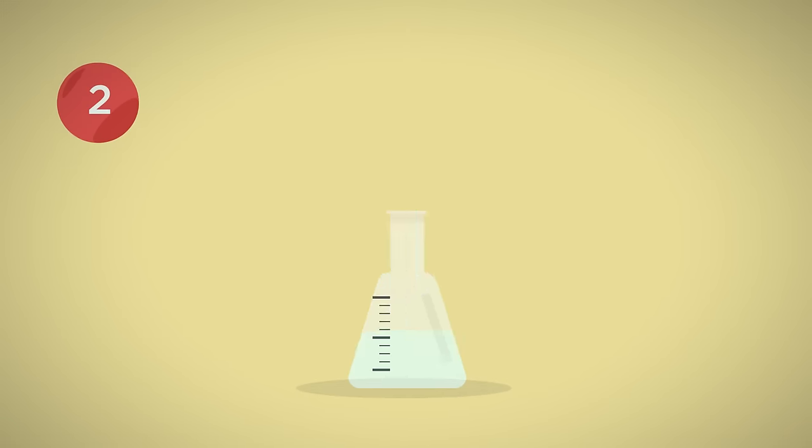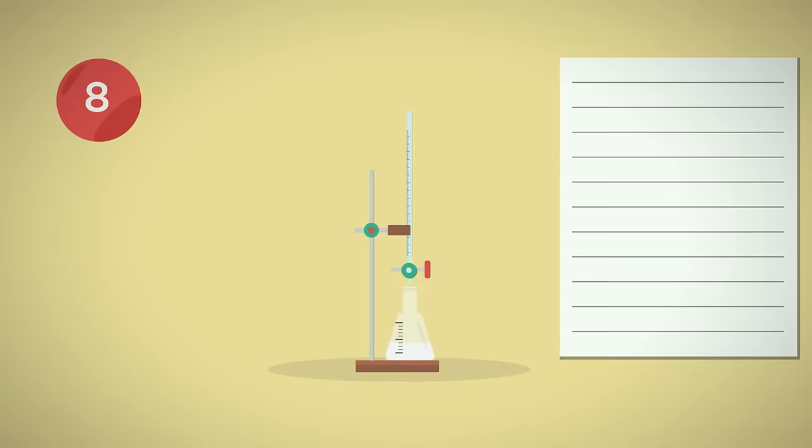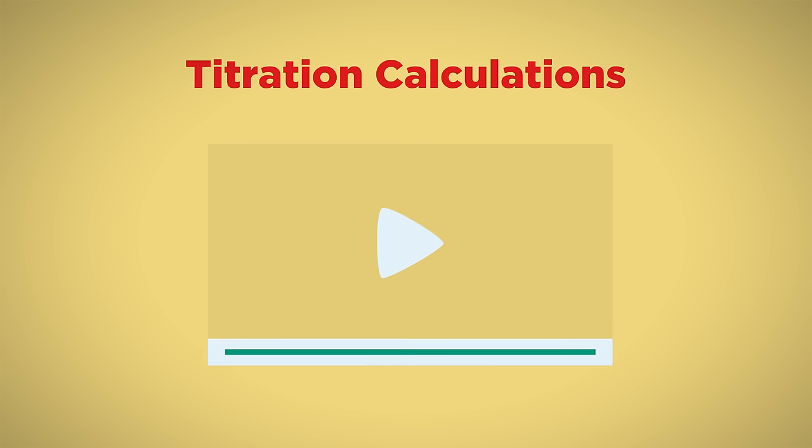So we have carried out the titration a few times and have a consistent titre value. What do we do next? Titration calculations. Now that you know how to carry out titrations, watch the second part of this video to see how to do a titration calculation to work out the actual concentration of the unknown solution.